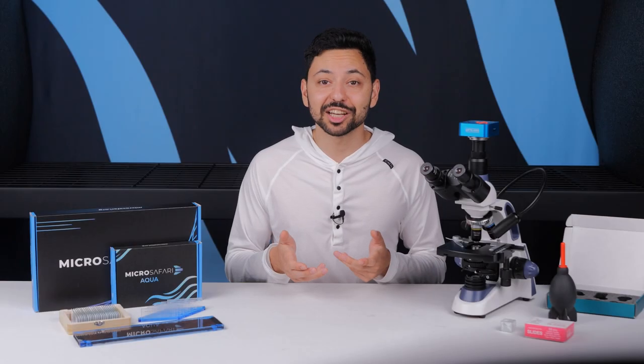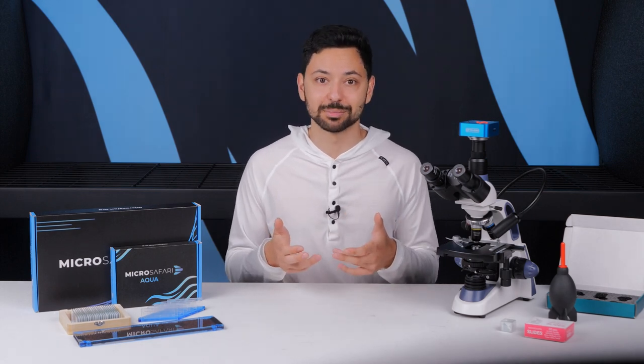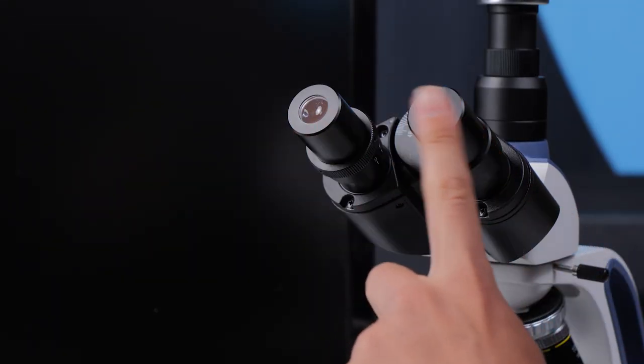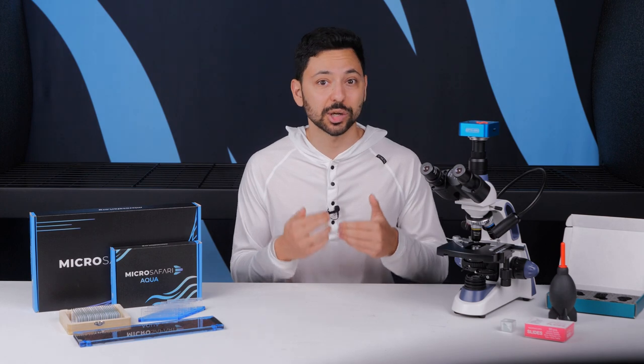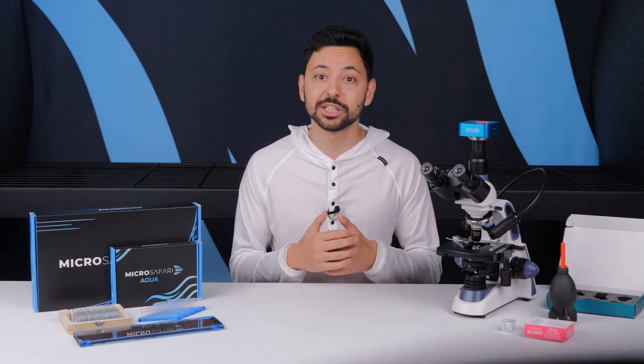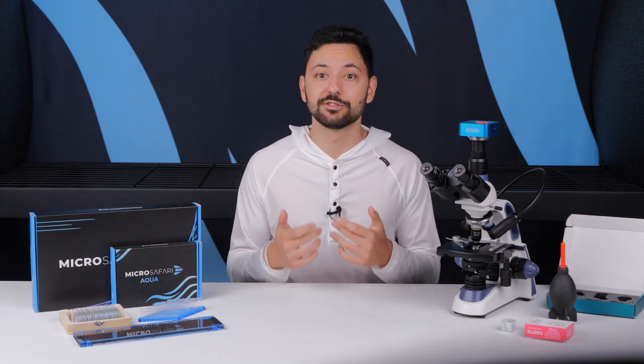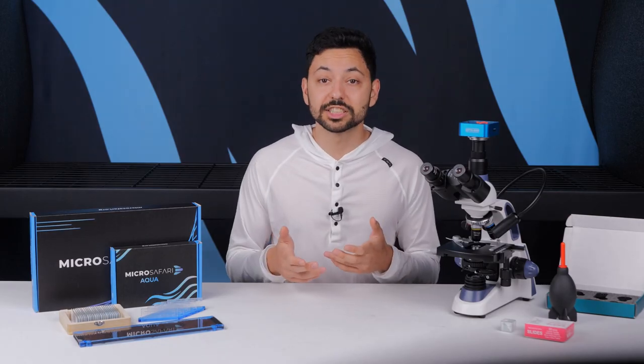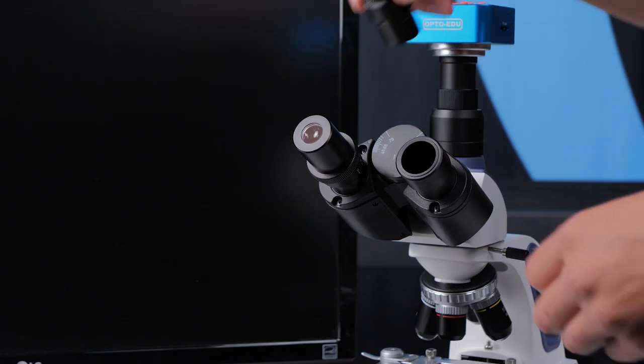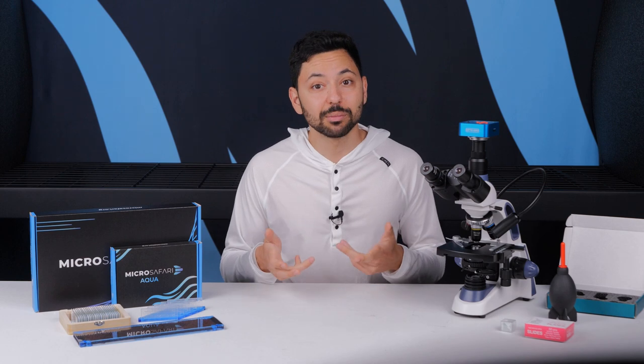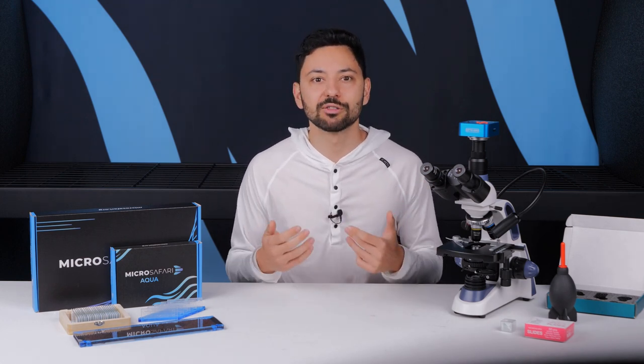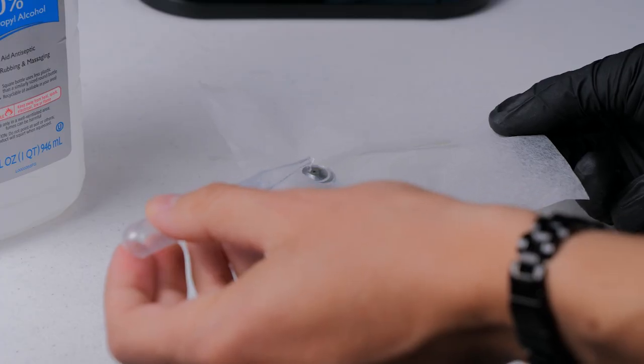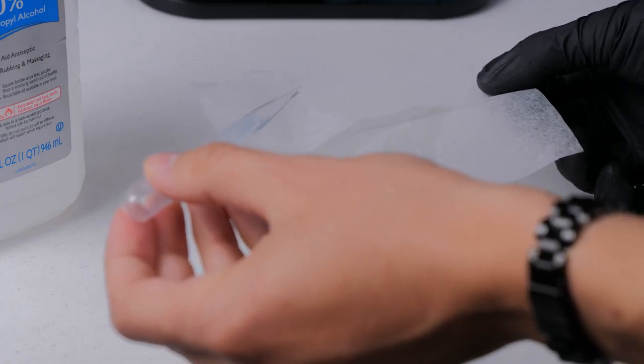Cleaning and maintenance. Cleaning and taking care of your microscope is a breeze if you follow these basic steps. Keep the dust cover on when not in use. Never touch any glass or lens or put it into direct contact with anything that could transfer oils or other contaminants onto the optics. Never wipe off optics with a microfiber cloth or lens tissue without first blowing off any loose dust. Don't use solvents to clean your microscope unless there's a reason to. Cover up open ports when you remove components. If you're using immersion oil be super careful to never accidentally rotate your non oil immersion objective into the oil. Promptly clean off the oil immersion fluid from your oil immersion objective after use.